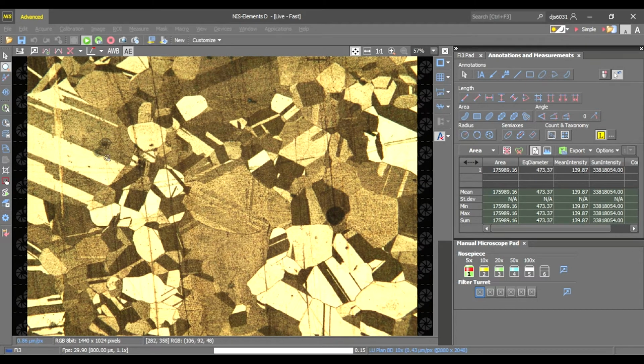Anyhow, there's a way to get the magnifying glass to stay on the image. I haven't found the right setting yet to get that to happen, but just keep in mind that that's an option if you want to do a little digital zooming on there, especially if you're at the maximum optical lens or something.